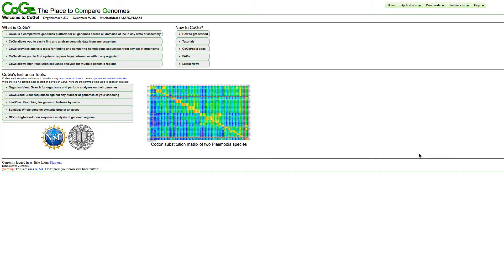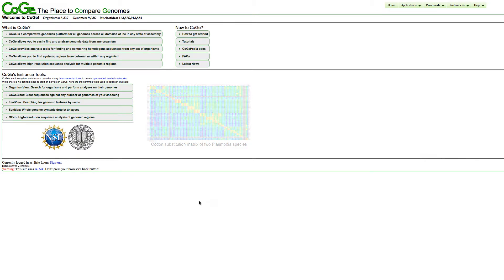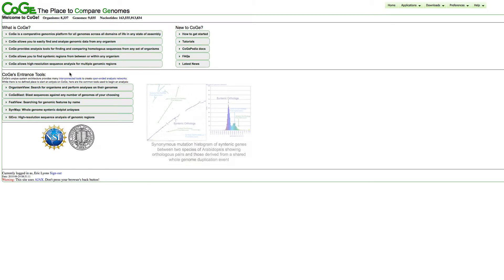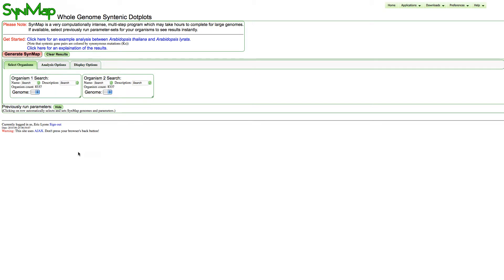This video focuses on doing whole genome comparisons using SynMAP of two Bacillus thuringiensis genomes. You can access SynMAP from Koji's homepage. When SynMAP loads, the first thing you need to do is search for the two genomes you want to compare.